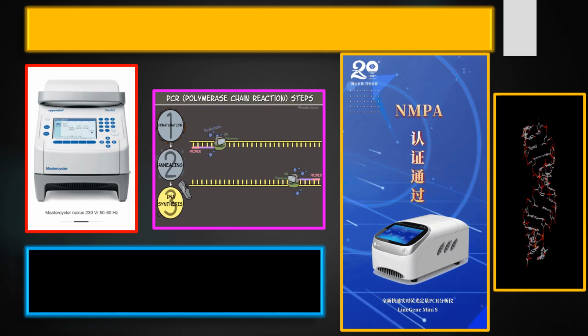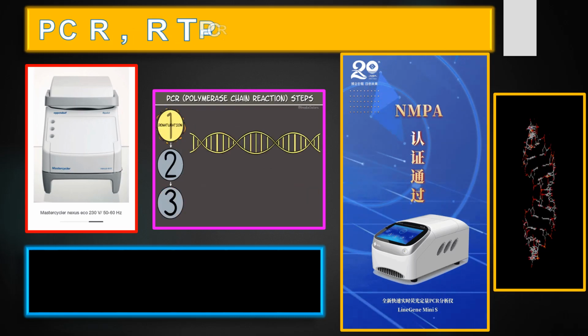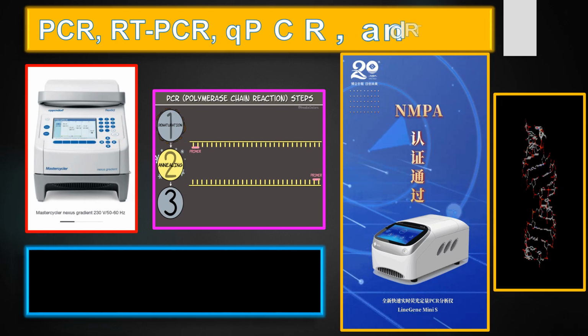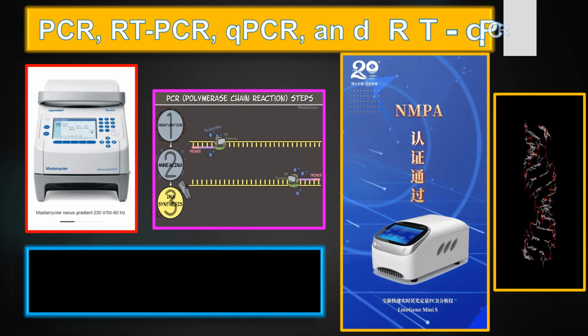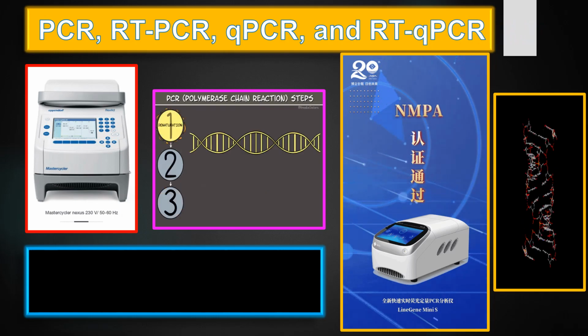What about the PCR, RT-PCR, qPCR, and RT-qPCR? Polymerase chain reaction, reverse transcription PCR, quantitative PCR, and RT-qPCR.